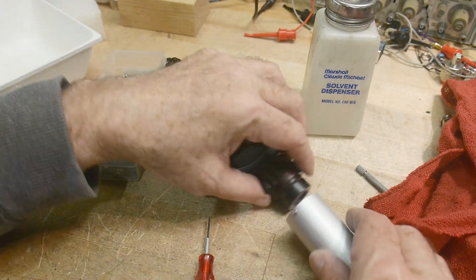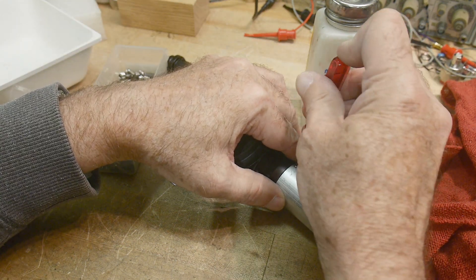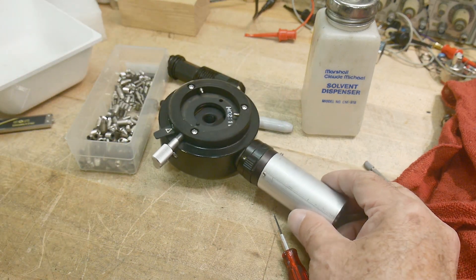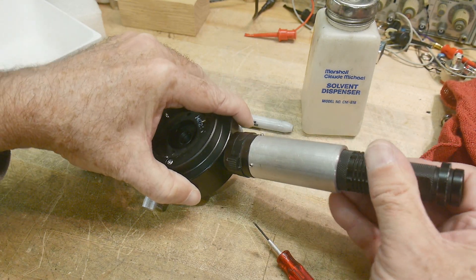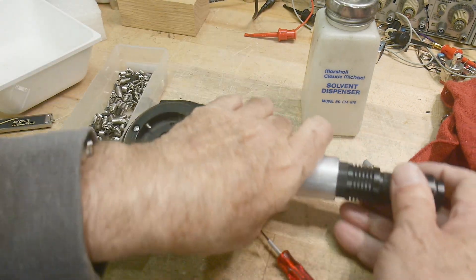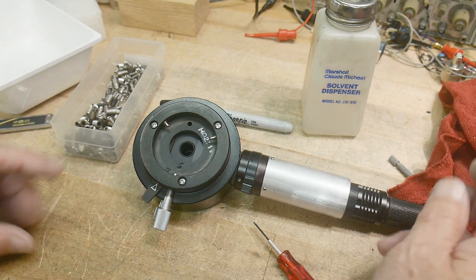Got my set screws in. Let's see if this is gonna work. Oh, very rigid, very nice. Then my flashlight will slide in here — nice, tight fit. I think I just got something in there. Alright, that's gonna work out great. Let's put it on the microscope and try it out.